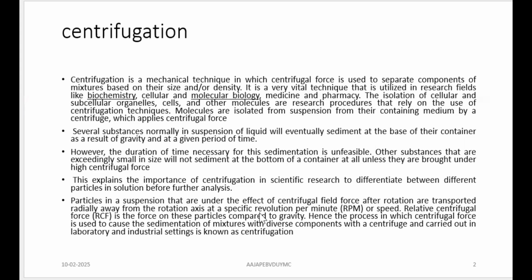How many times is the centrifuge rotating in a given unit time, say 1 minute? So 10,000 times, 5,000 times, 2,000 times. That is how we describe RPM. But there is another factor, that is relative centrifugal force, that is RCF.